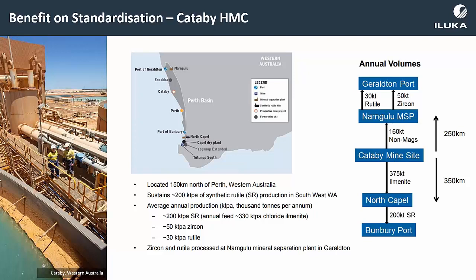When the business kicked that off, it was decided to use the Southwest methodology for determining mineral assemblage. Because of our centralised system in Narngulu, we didn't use that at the time, but we were able to use the scripts that were in the Southwest and the scheme that had been produced.